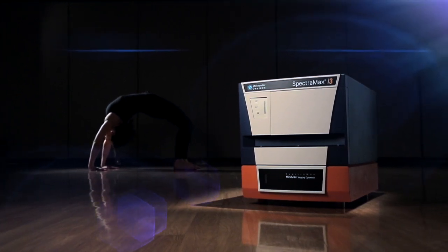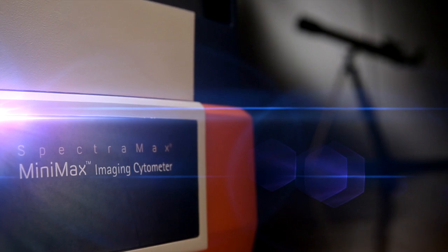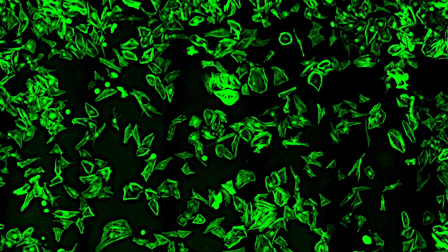When is the last time you inspected your cells and ran an assay on the same instrument? With the user-upgradeable imaging cytometer option, turn your microplate reader into a cellular imager. Unlock a new world of applications.